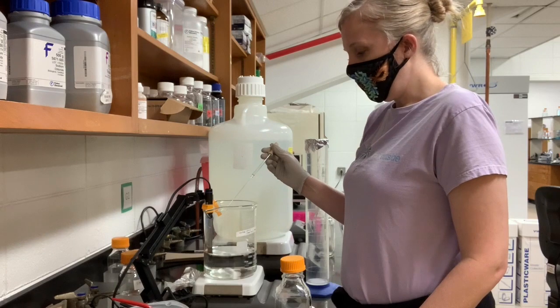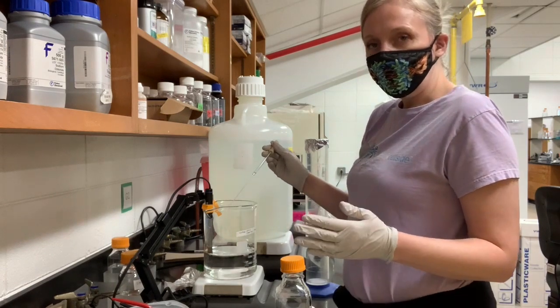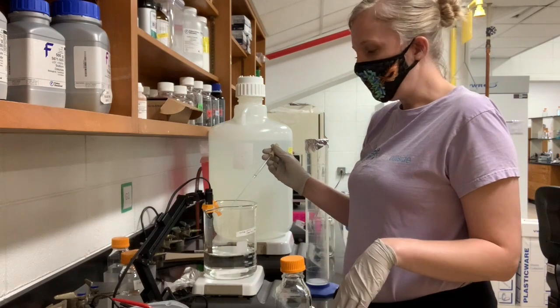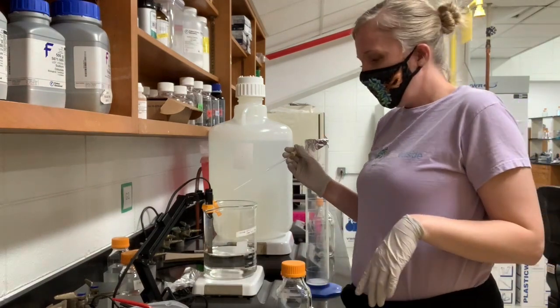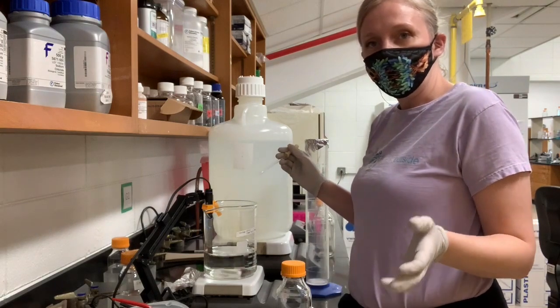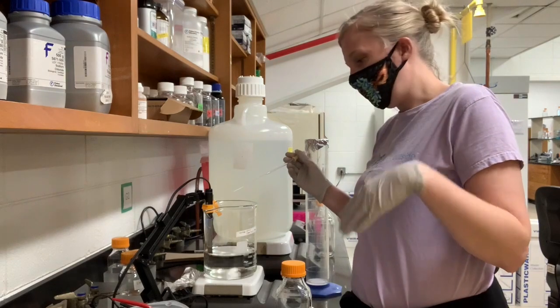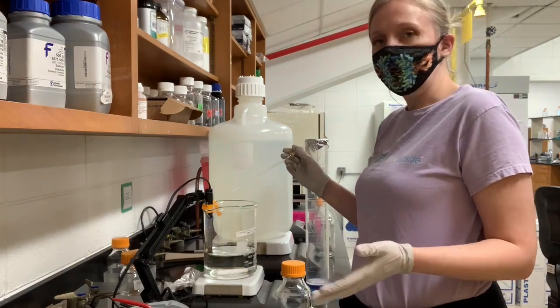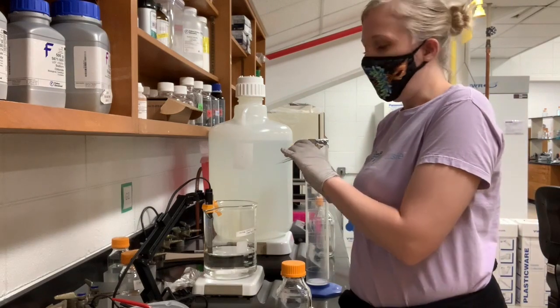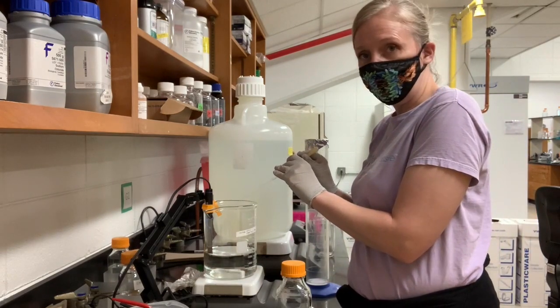Again, as I mentioned when I was talking about weighing the chemicals, the more precise you can be in your buffer making when it comes to pHing, the more reproducible your results will be. So if you make a solution that's supposed to be 7.4 and sometimes it's 7.39, 7.38, 7.42, then there could be subtle variations in your solution that could cause problems down the road. So I have a pH of 7.4.